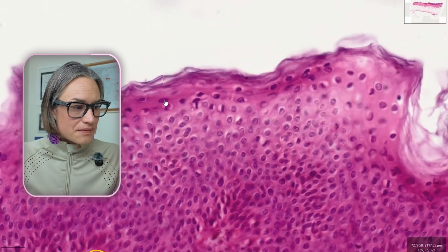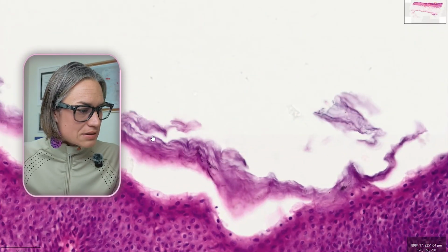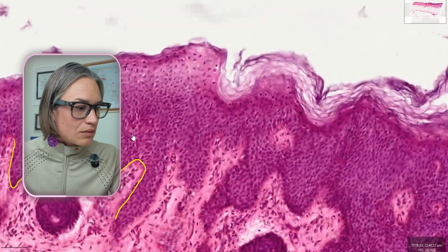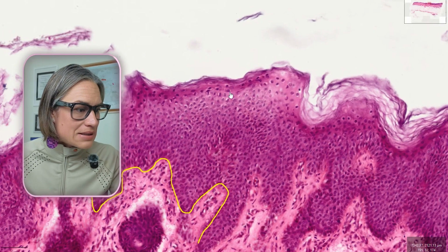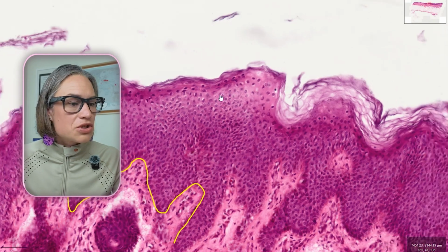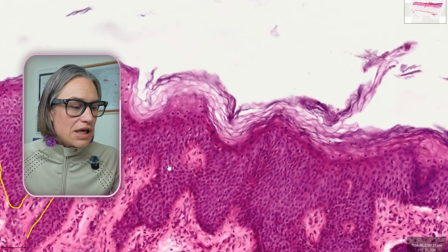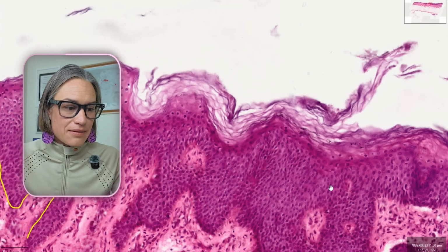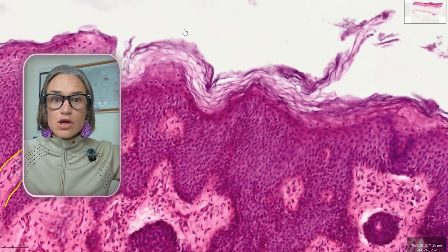And then something starts to happen. They start to fall off. They start to die. They maybe had too much injury, there is too much friction, and they don't have enough vascularity. Well, there is no vascularity here at all. So they fall off.